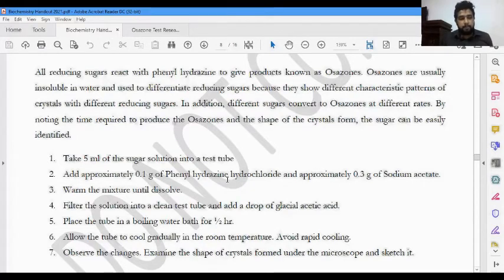Buffer එකක් කියලා කියනවා. In here actually we have a buffer. What is that? Yes, we use buffers to have a definite pH, or for the pH to remain in a very narrow range. Then here there is a buffer. What is that? We add only a few sodium acetate. So can sodium acetate itself be a buffer?